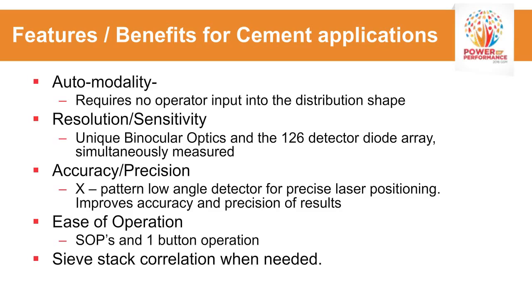Because usually, laser diffraction instruments measure more of the volume of the particle, so when you're sieving, you're measuring the middle dimension of a particle. So you can correlate back to this size. You can apply a correlation factor in the instrument's output to correlate directly to screens that you use.